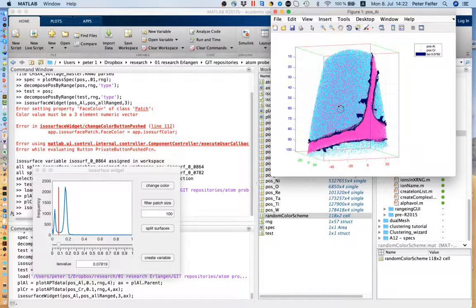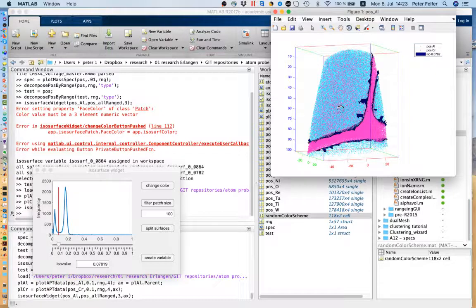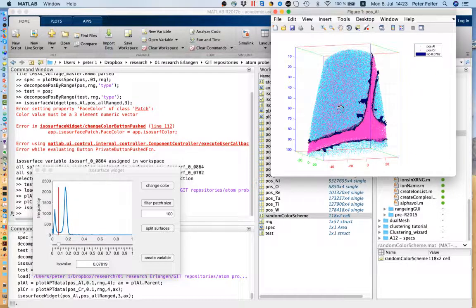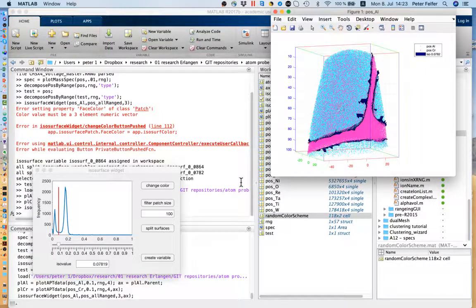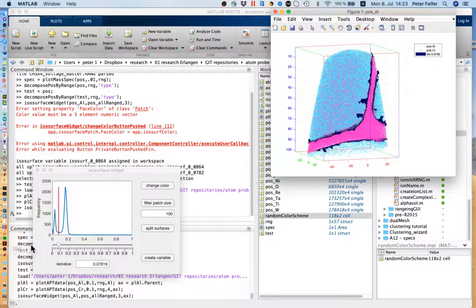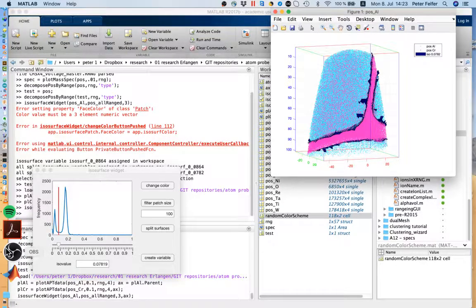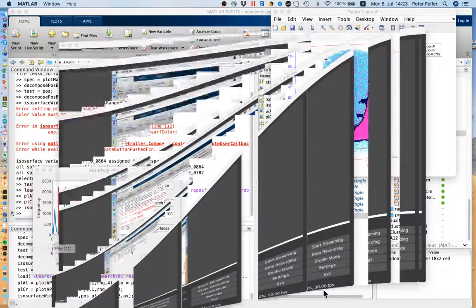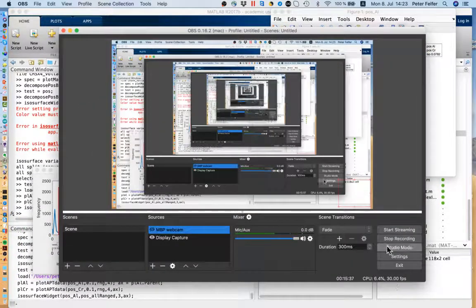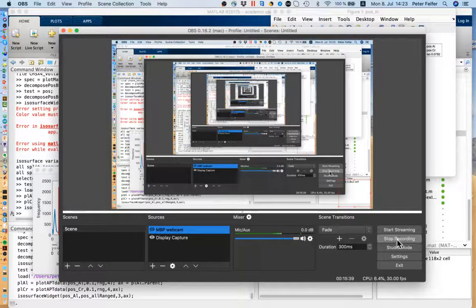Anyway, that's the new isosurface widget and some of the updates on the plotting tools. I hope that is of help to all of you, and I wish you a great time doing analysis in MATLAB of isosurfaces and other things in atom probe.